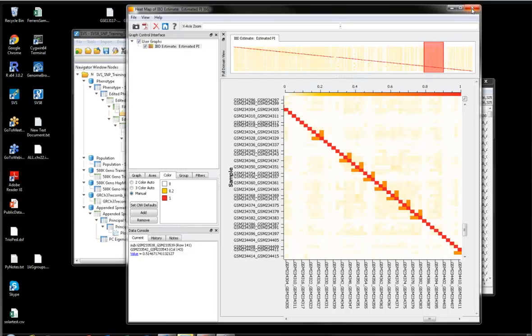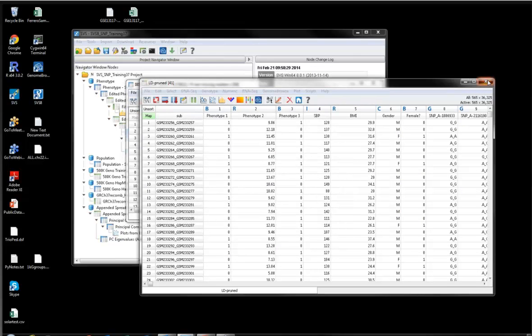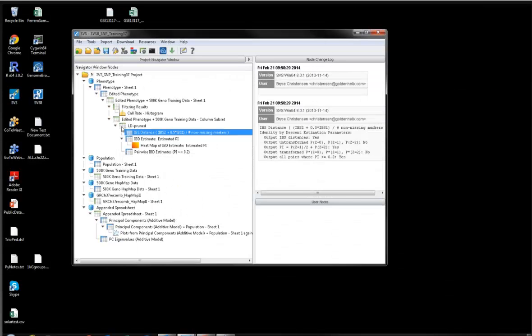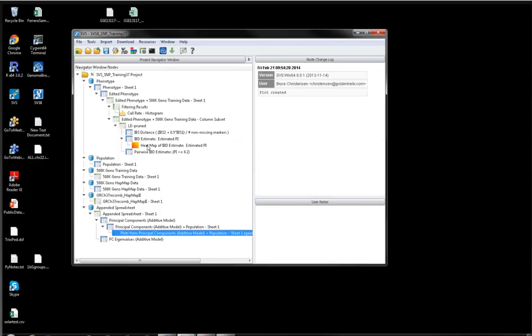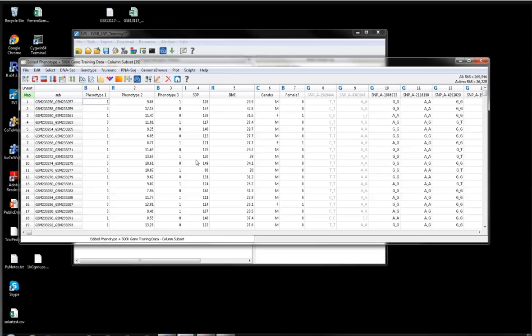So now that we've done that, we've gone through a relatively thorough workup on GWAS quality. There's obviously a lot more things we could look at. We could get into heterozygosity, we could get into inbreeding coefficients, different directions we could go. But we've looked at the principal components down here to see population structure. We've looked at pairwise relatedness. And what I'd like to do now is come back and just run an association test.